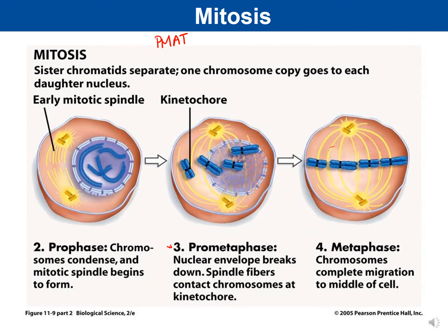Notice that we have two centrosomes. They're at opposite ends of the cell. They moved towards opposite ends of the cell in prophase. In metaphase, when they're at the opposite ends of the cell, that's when the sister chromatids line up single file along the metaphase plate so that a sister chromatid faces each of the centrosomes.